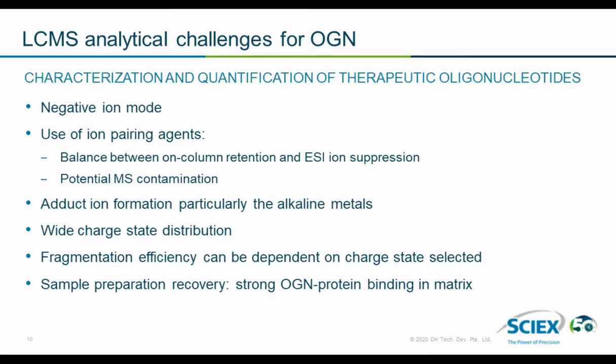So you've got to be careful of the amounts of ion pairing reagents used. I've actually encountered ion pairing contamination in LC systems before now. Typically people using lots of high concentration ion pairing reagents tend to have a dedicated LC system for this, or they have to do extensive cleaning afterwards. So ion pairing reagents are essentially a pain to handle sometimes, and they impact swapping between analyses on the same system.